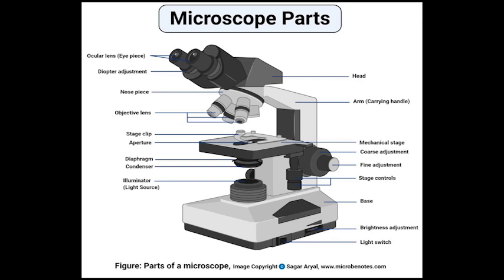The lens refracts or bends the light to give a magnified image of an object.